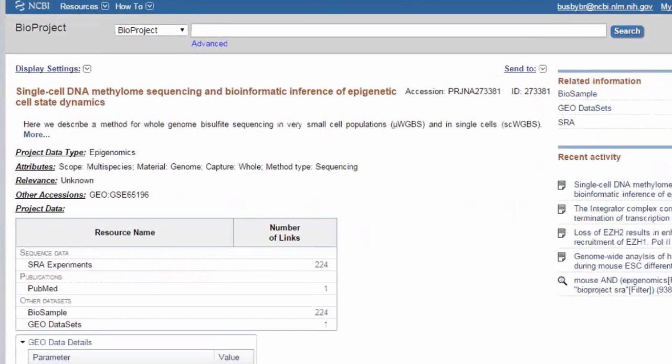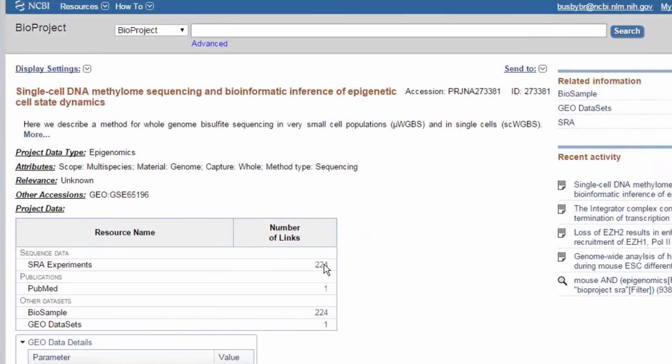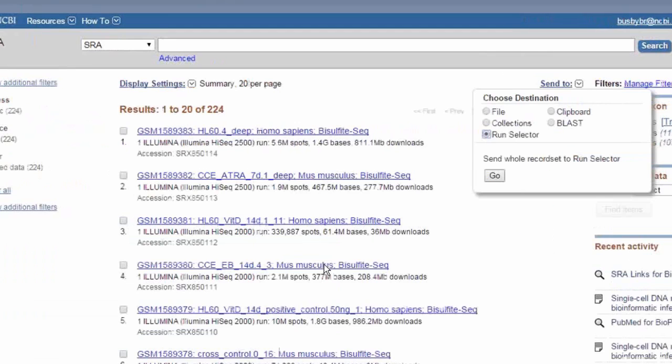Note that this is an active link. We can go there. And then once we get to SRA, we can send those to something called the Run Selector from the Send To button.